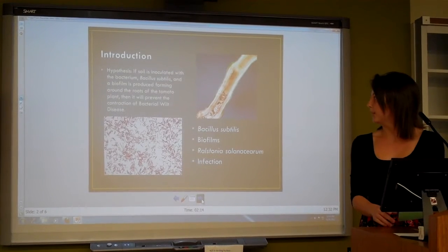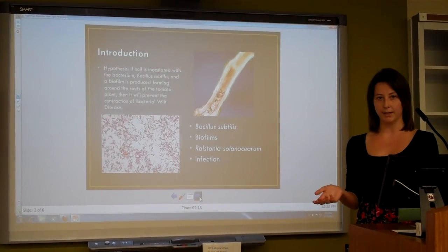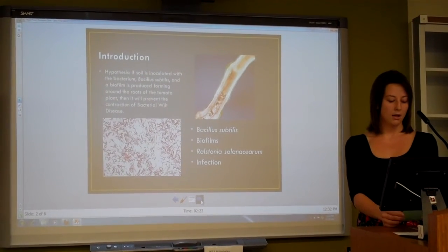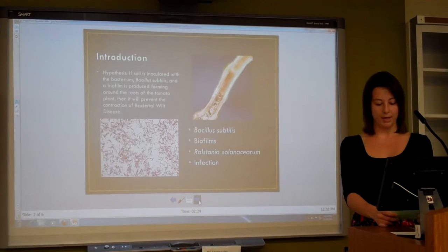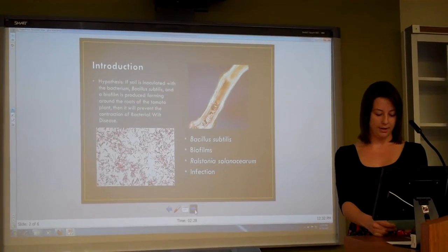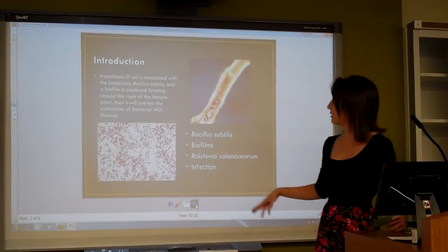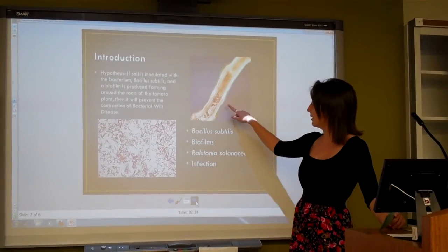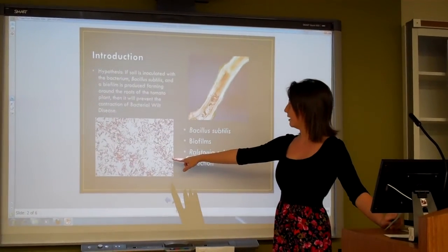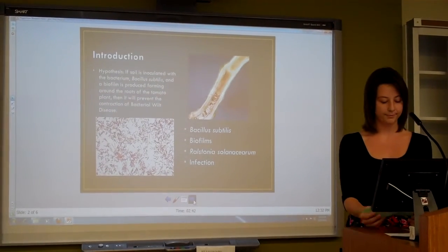We won't be able to see results whether the infection has occurred or not until the plants have finished growing, and I'll have to look at the flowering and the fruiting. On an internal level, increased respiration will occur, and also a reduction of transpiration and photosynthesis. These pictures are just how the infection occurs. It's going to block the vessels. And this is also just my Bacillus subtilis, what it looks like. It's the gram-positive bacterium.